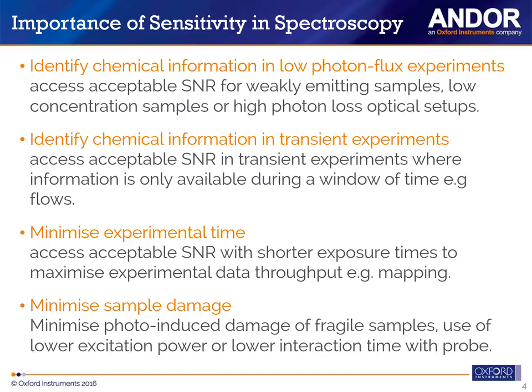Finally, another example of why you would need a good sensitivity camera is, for example, to get a good signal-to-noise ratio very quickly to be able to minimize the exposure of a sample to the probe, for example, a laser or flash lamp or things like that. And some samples are more sensitive to light than others and can be degrading over time more quickly if exposed more thoroughly to the probe. So the quicker you can get this chemical information, the less probe you need to interact with a sample.